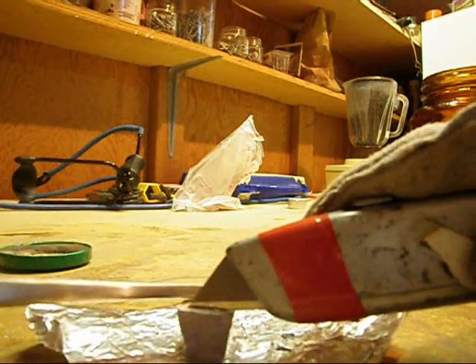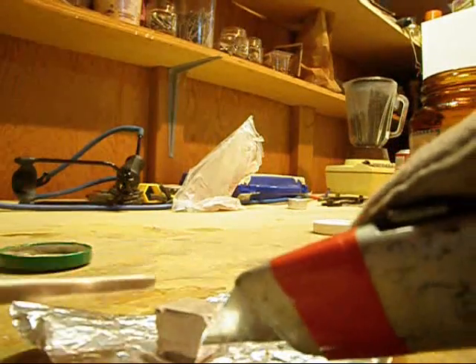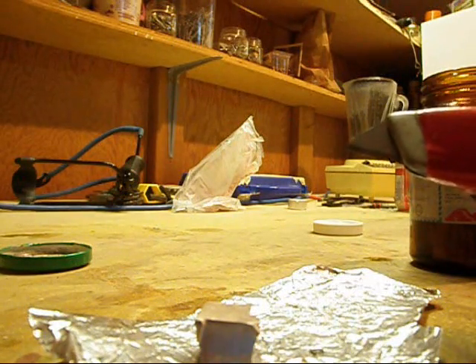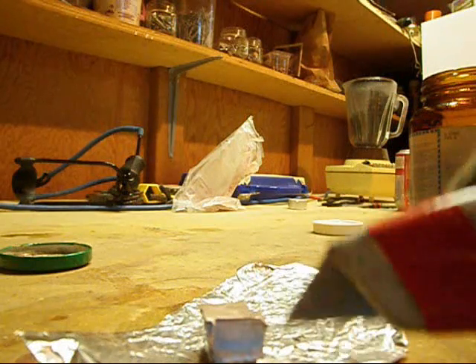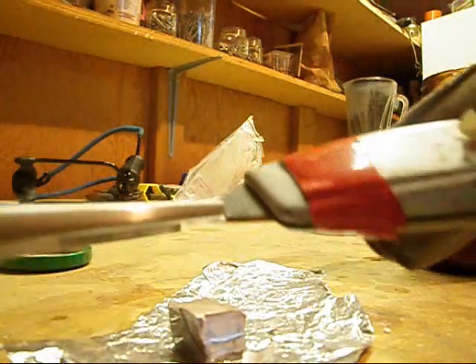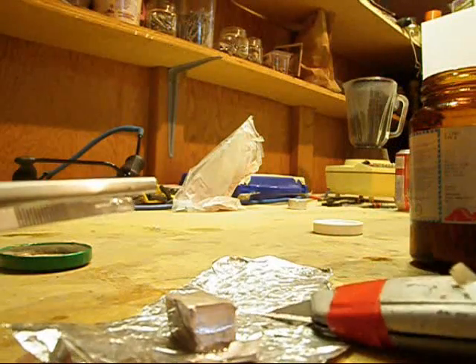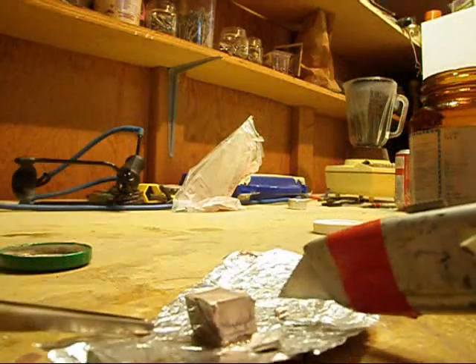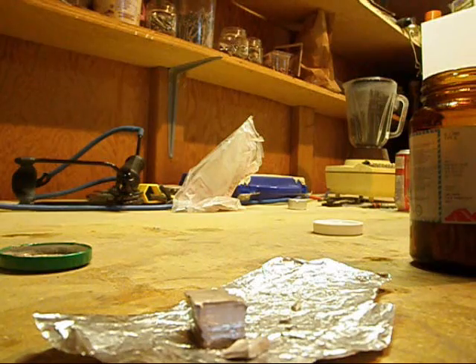Sodium is very easy to cut with a knife, probably like cutting hard, cold plasticine. And you can see it's shiny and it is very quickly re-oxidized. Sodium is slightly less dense than water, melts at 98 degrees Celsius, and is very reactive with water, and can spontaneously ignite in a moist or oxygen-rich environment.